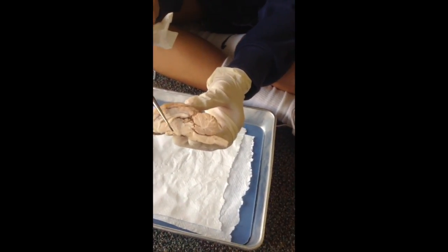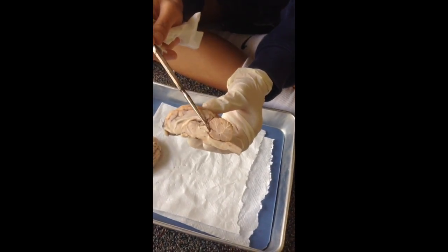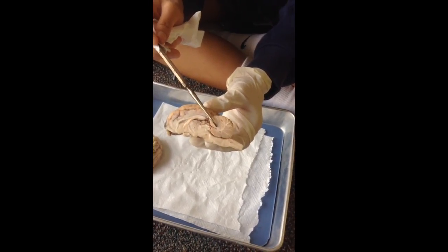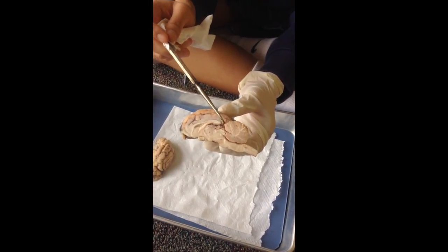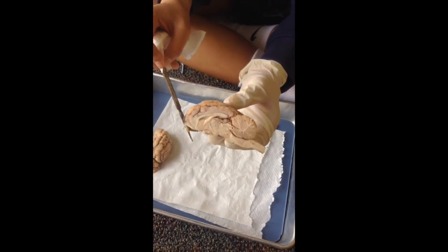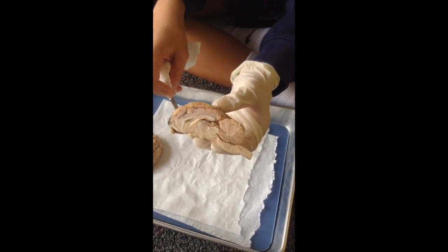Arbor vitae. It's white matter that brings sensory and motor information to and from the cerebellum. Optic nerve is something that's not pictured here, but it's the nerve that carries neural impulses from the eye to the brain.